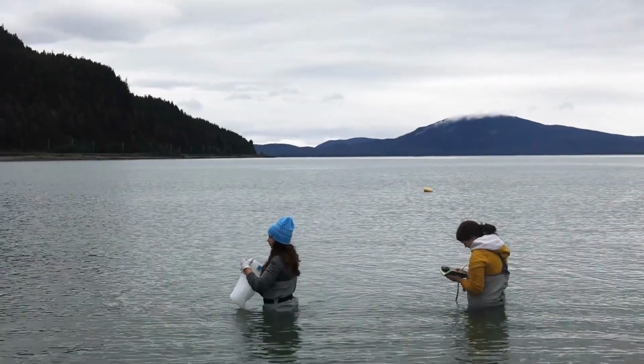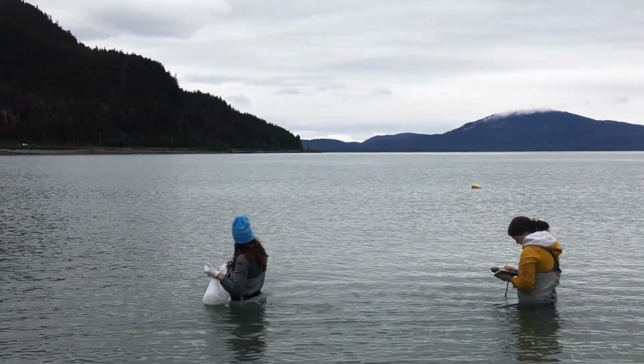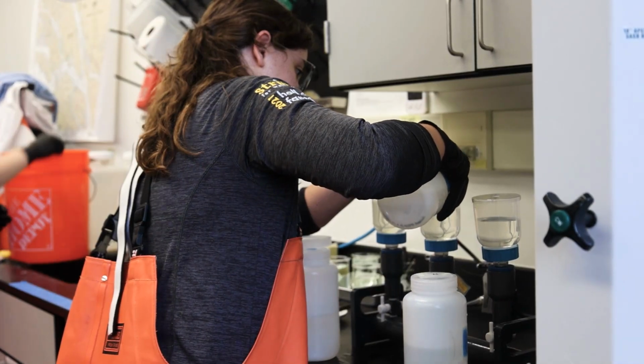eDNA stands for environmental DNA, and environmental DNA is fragments of DNA that come from organisms that live in the water column, in our case. The process starts in the field where we take our water samples and then filter them down so we can mail them back to our lab here.